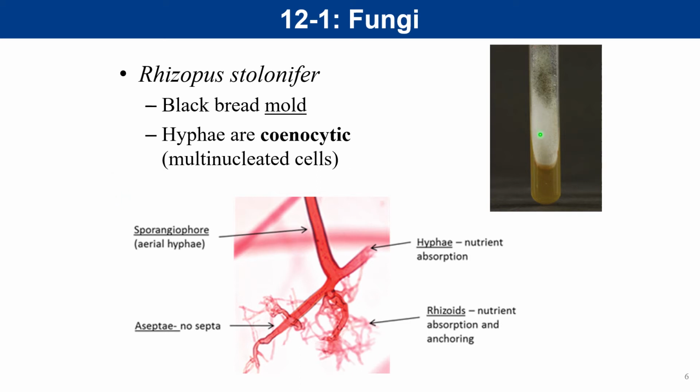If you were to take this growth and put some sticky tape on it called fungi tape, it looks like clear Scotch tape or sticky tape, and then put a sample of it with some dye under the microscope, you would see these various hyphal structures. And these hyphae have specialized parts. The finest little growths of hyphae are thorny looking, and they finger out into these delicate little structures called rhizoids. And rhizoids are specialized for absorbing a lot of nutrients and moisture, as well as for anchoring the organism down, like a plant or a tree, into its environment.